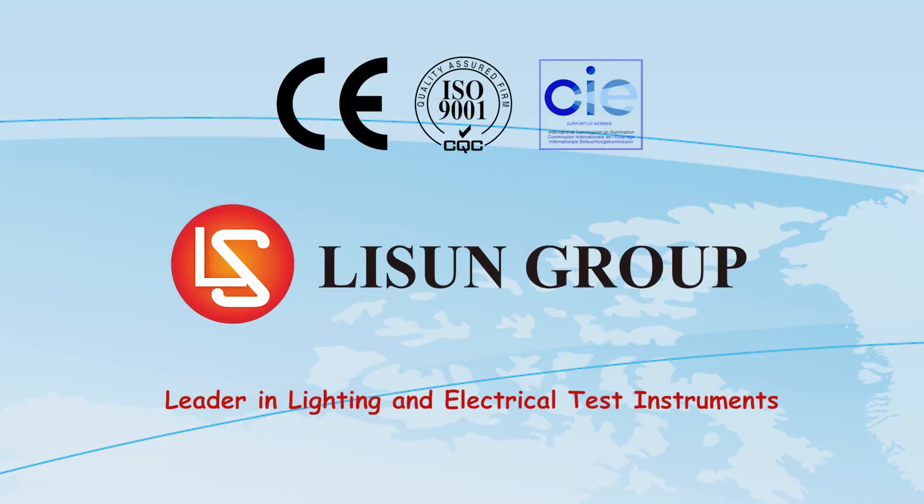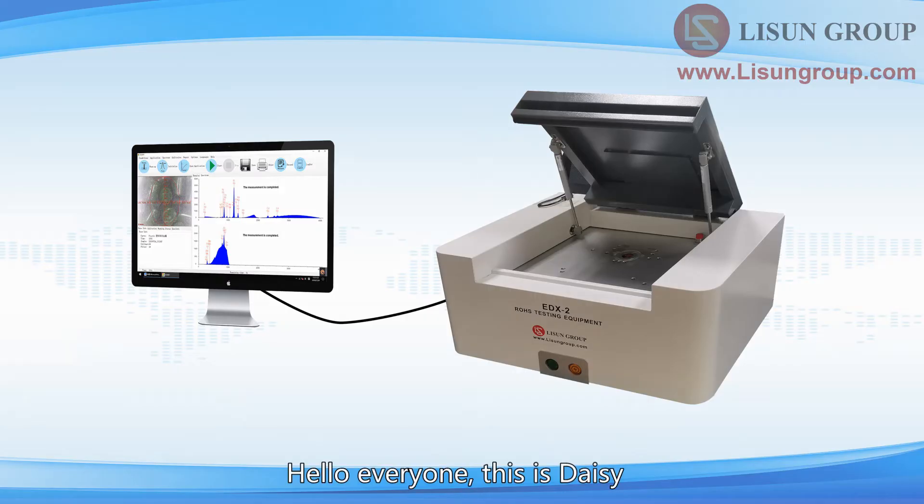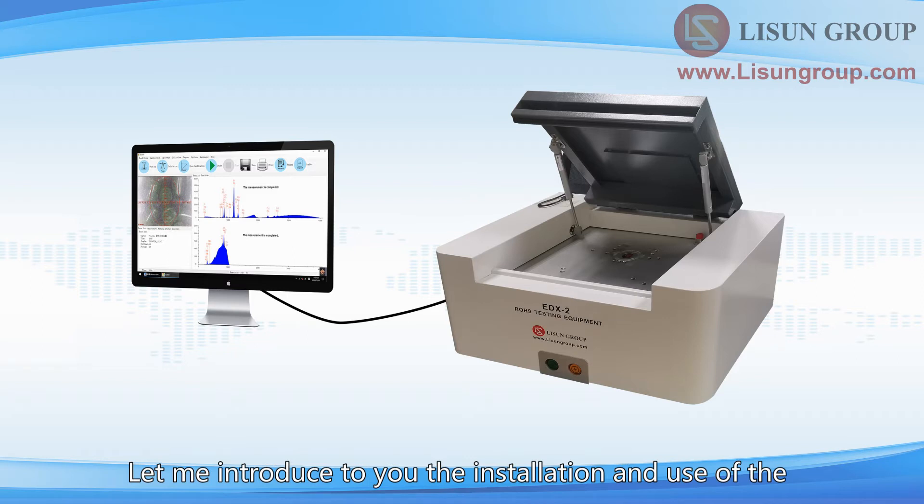Lasun is a leader in lighting and electrical test instruments. Hello everyone, this is Daisy. Let me introduce to you the installation and use of the EDX2 Rose testing equipment.